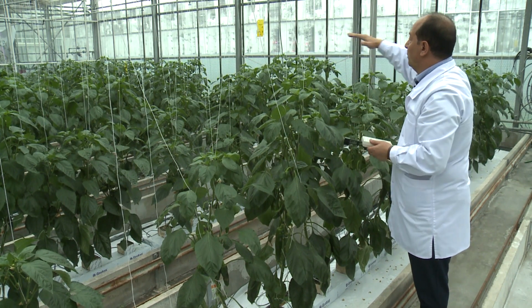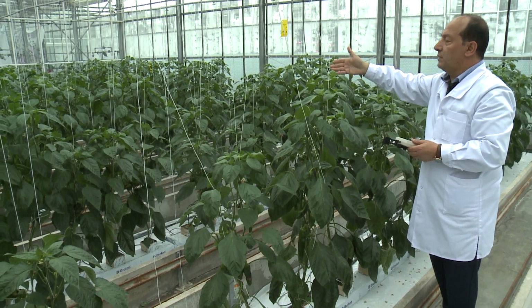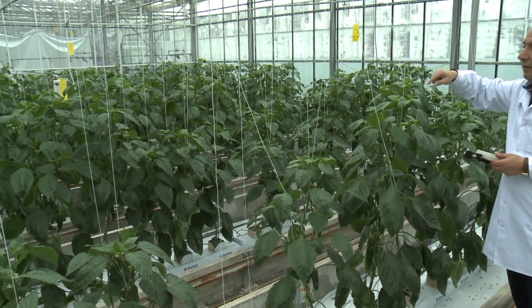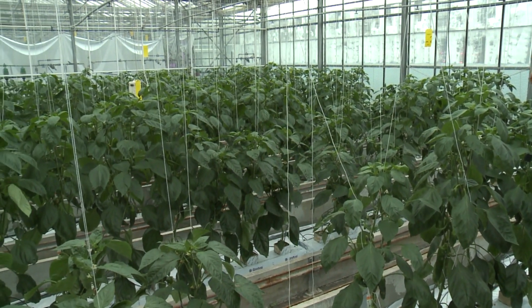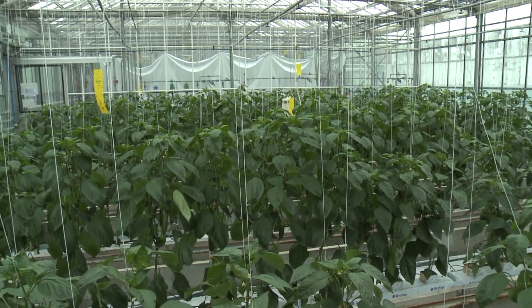And then if I would like to make measurements or to talk about the chlorophyll content of the plants here in this place, I have to make at least many repetitions for many plants, the same as I did with these plants here.